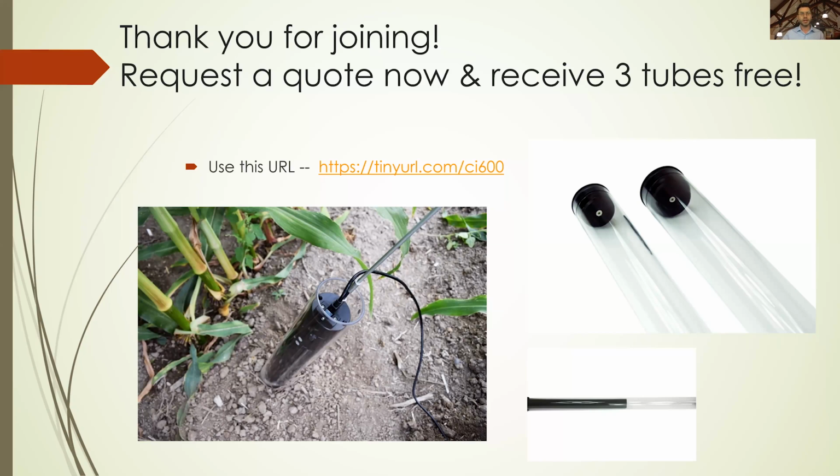The next question I see is, how do we install it in, say, a hydroponic setting? That might be a bit more than I can go into detail on this slide. The thing I do want to mention is that the instrument is actually very resilient to different environmental effects, with the caveat: do not just stick it straight into water. Like most electronics, you don't want to just submerge the whole thing. But even in high moisture, high humidity, we've had it at 95 plus and it works just fine.